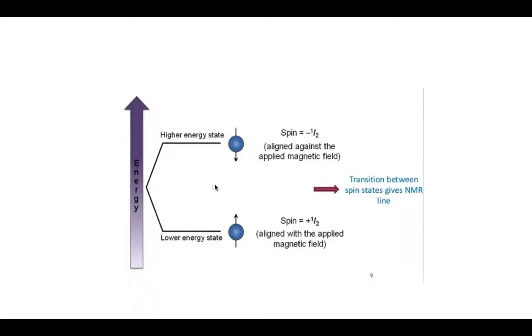The gap in energy between them can tell us what types of hydrogens they are, meaning kind of where in the molecule they are and what other atoms might be around. And this energy that's given off is in the radio wave frequency. Very, very, very low energy. But we can read that energy that's being given off when the magnetic field is being applied, and that will tell us something about the hydrogens.